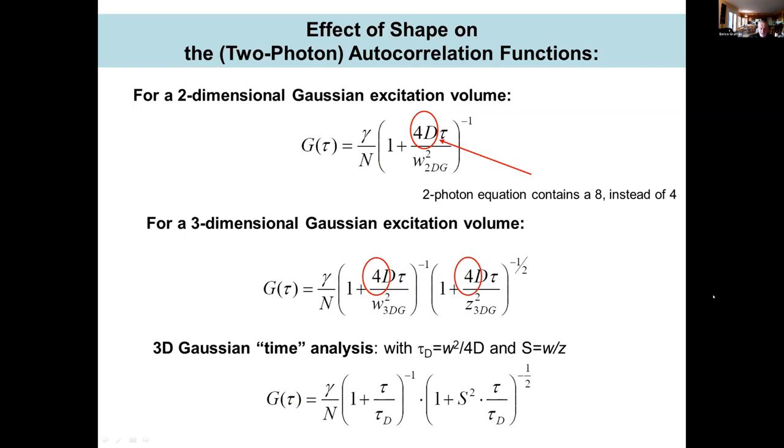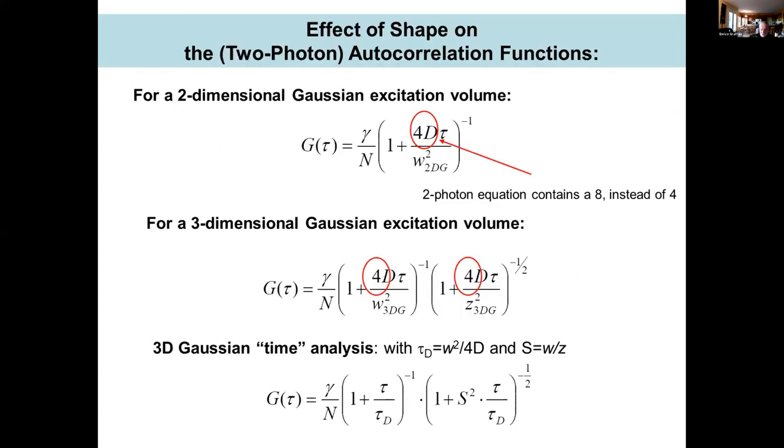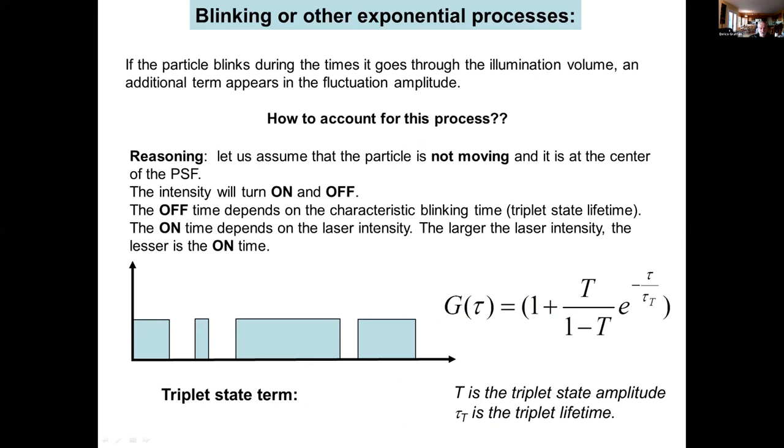So this is in some way very simple, and some time ago I was bothering my student by doing this calculation, which is interesting to do at least once in your life, but it's very simple if you know how the concentration changes as a function of time. So suppose that we have now a different process, and this is very interesting.